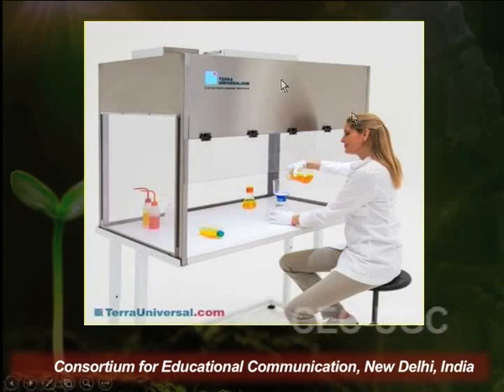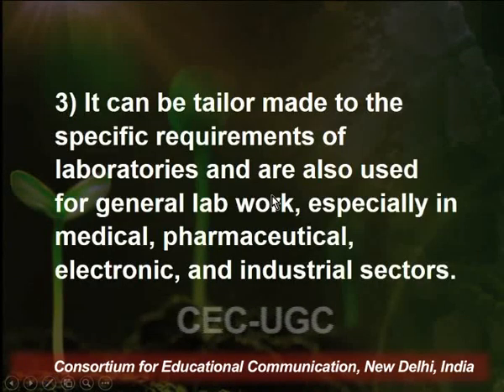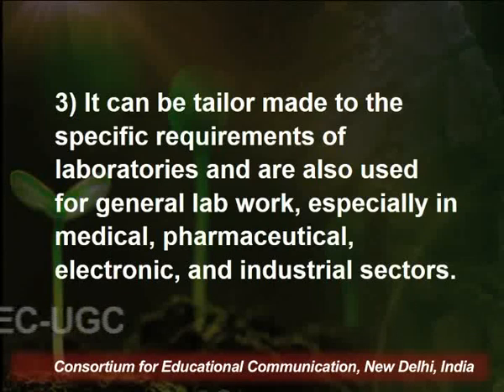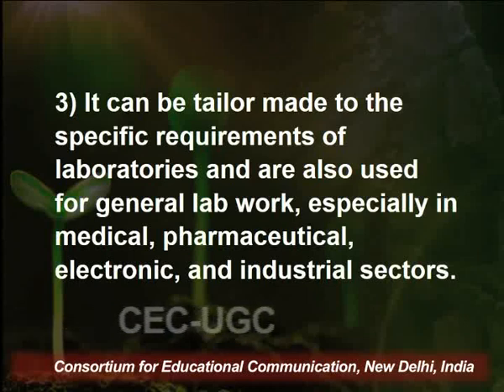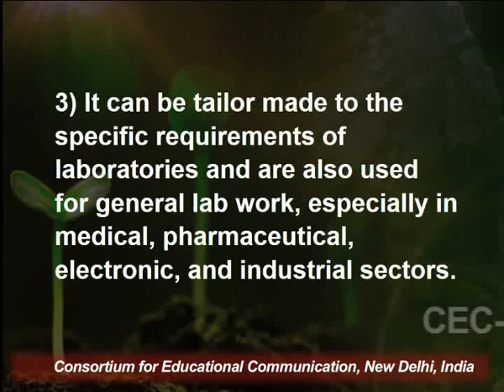This is a cabinet or an area under which the air is always maintained in motion, and with the flow of air inside this chamber, this entire area is maintained contaminant free. These laminar flows can be tailor made to specific requirements of laboratories also, and are also used for general lab work, especially in medical, pharmaceutical, electronic and industrial sectors.